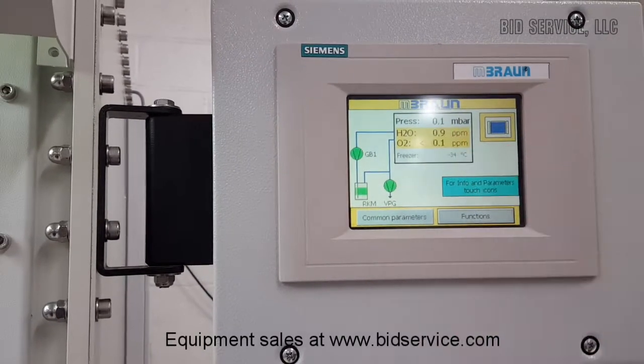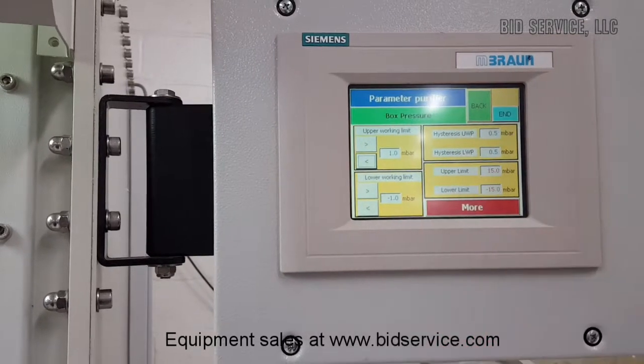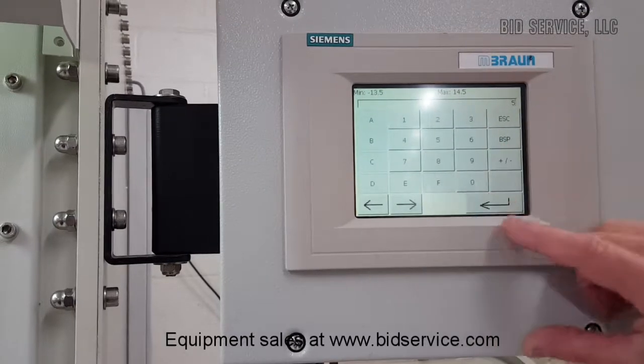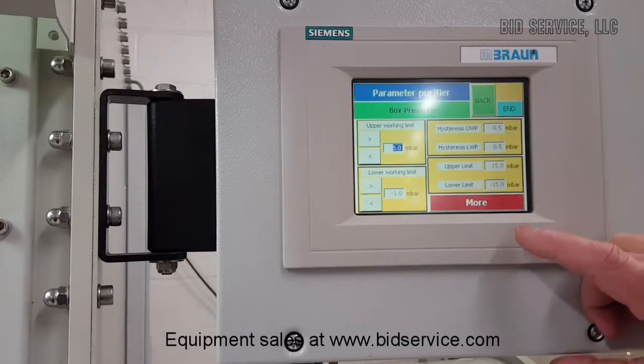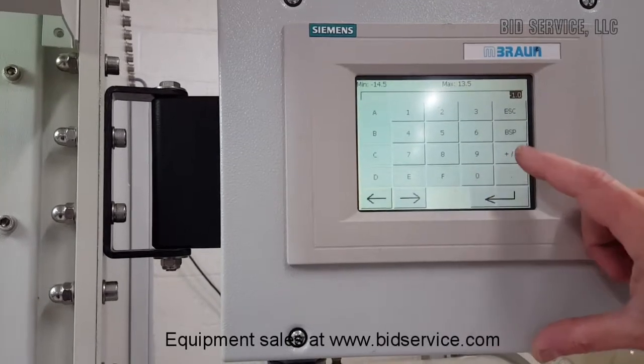Just to show you how to set the pressure, you hit this screen here. And then you have your upper and lower limits. I'll change this to 5 millibar and then minus 5 for the lower. So that's our range that the box can go through.